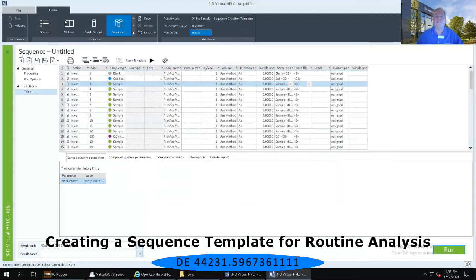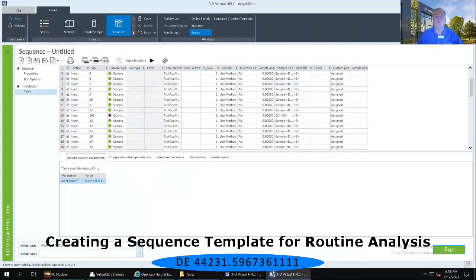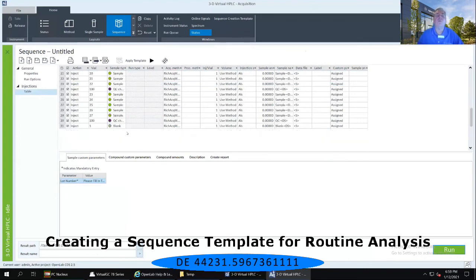I've got my blank as the very first injection, then my calibration standard in the second file position at level number one with three injections per vial. Then I have samples one through ten, followed by my first QC check, second samples one through ten, followed by a second QC check, and the final one through five, followed by a final QC check — because even though I didn't ask for it, it knows I need a QC check prior to exiting this particular sequence.